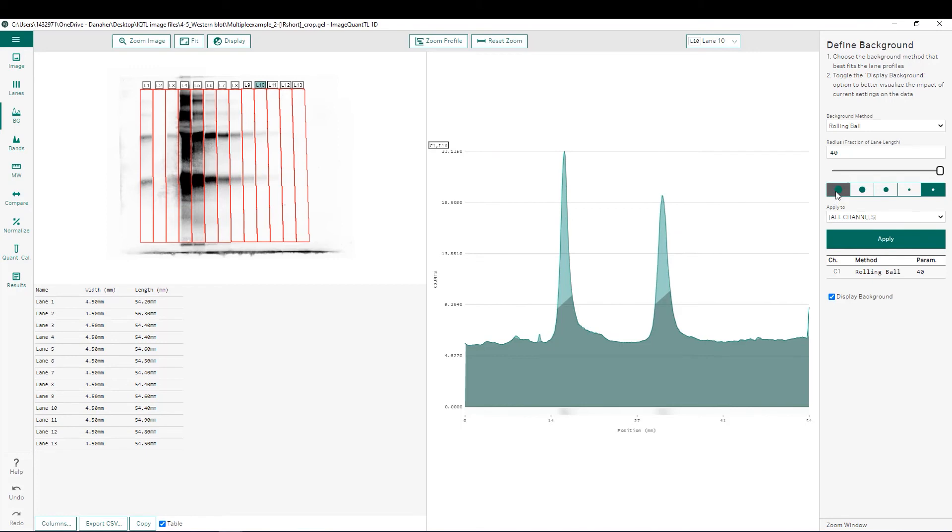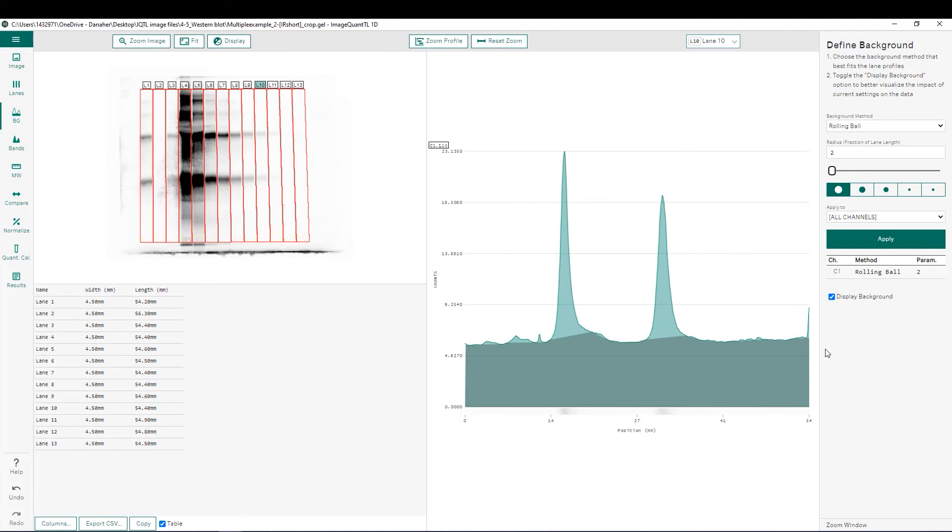In this case, we want to choose a fairly large ball that's going to contour to our background but not go within each one of those peaks. While this is a localized background that contours to the background within each one of our lanes, we are using the same radius to subtract within each one of our lanes within the gel. This is advantageous because we have one radius that we're using for our background subtraction. That means that our background subtraction can be replicated between different users that are quantitating the exact same image.